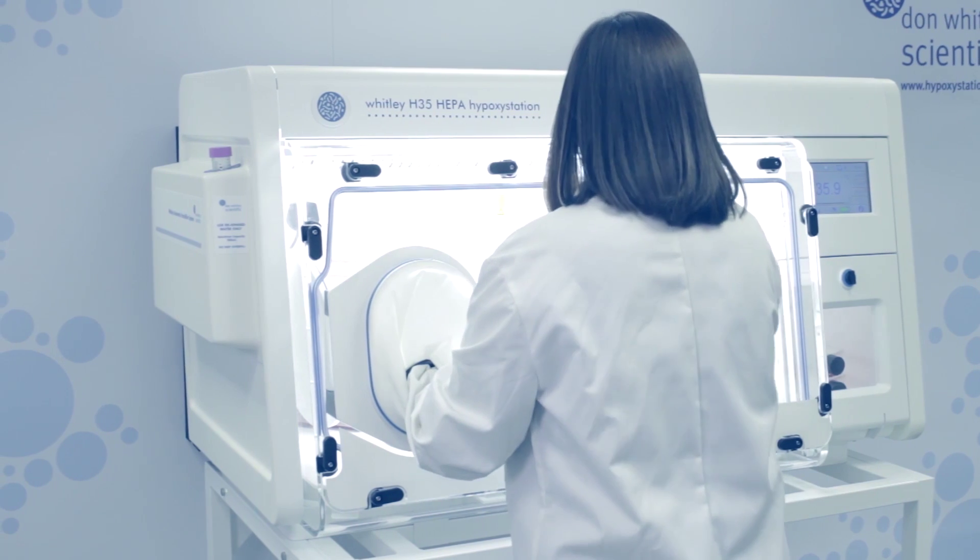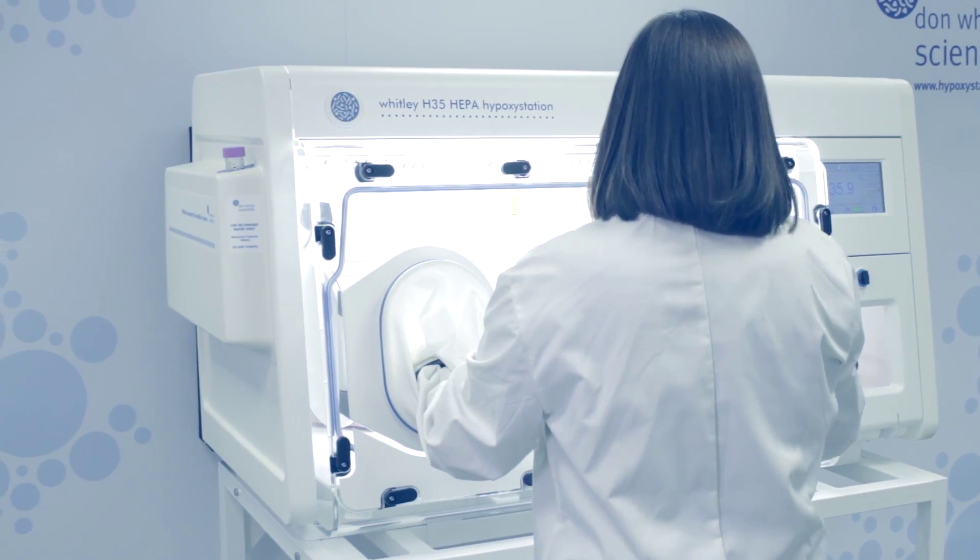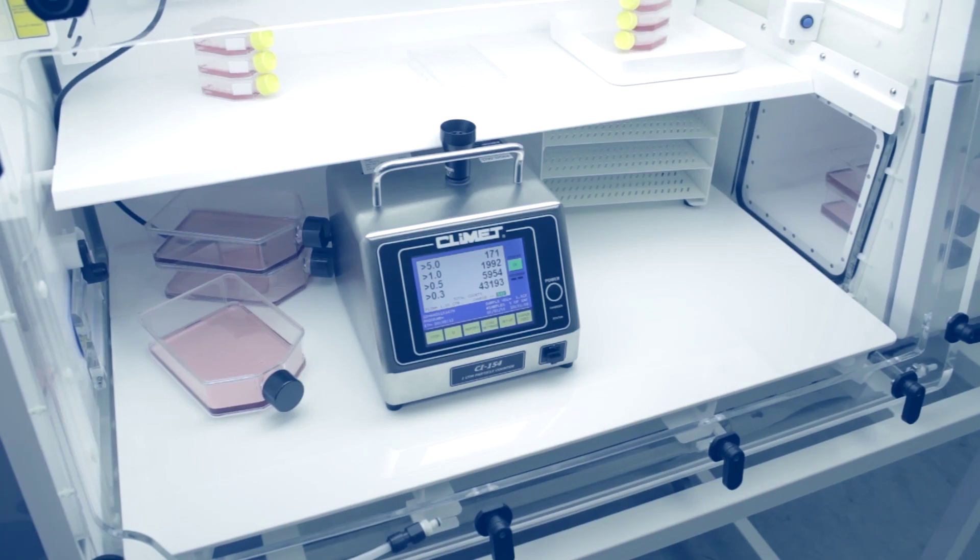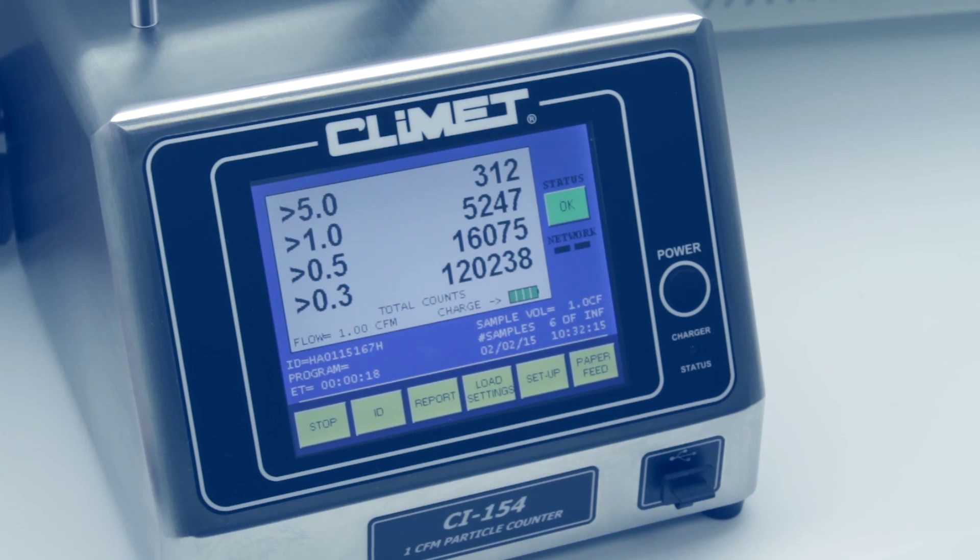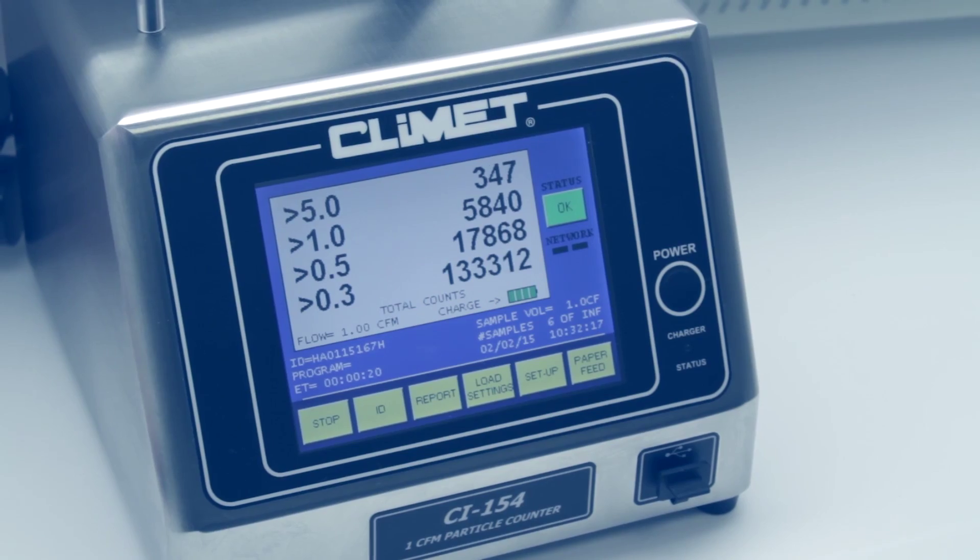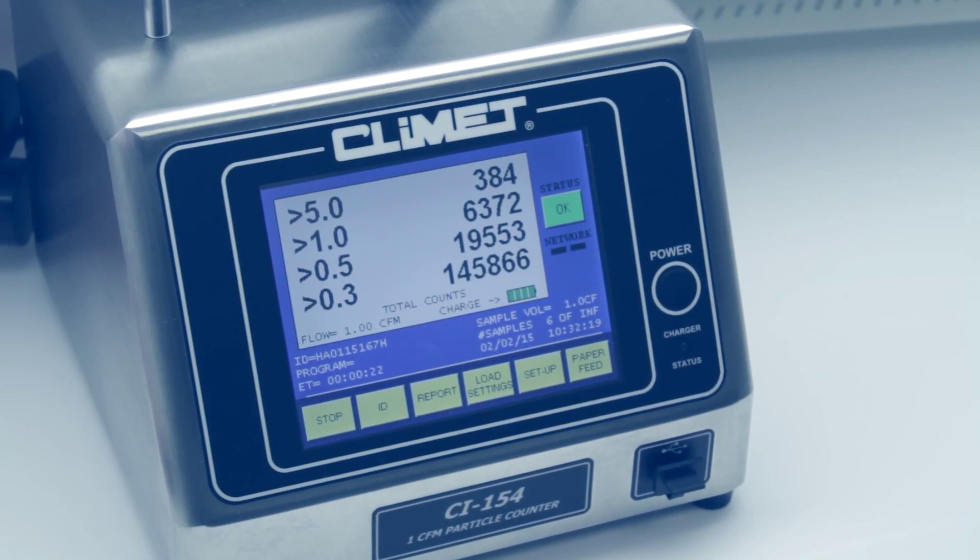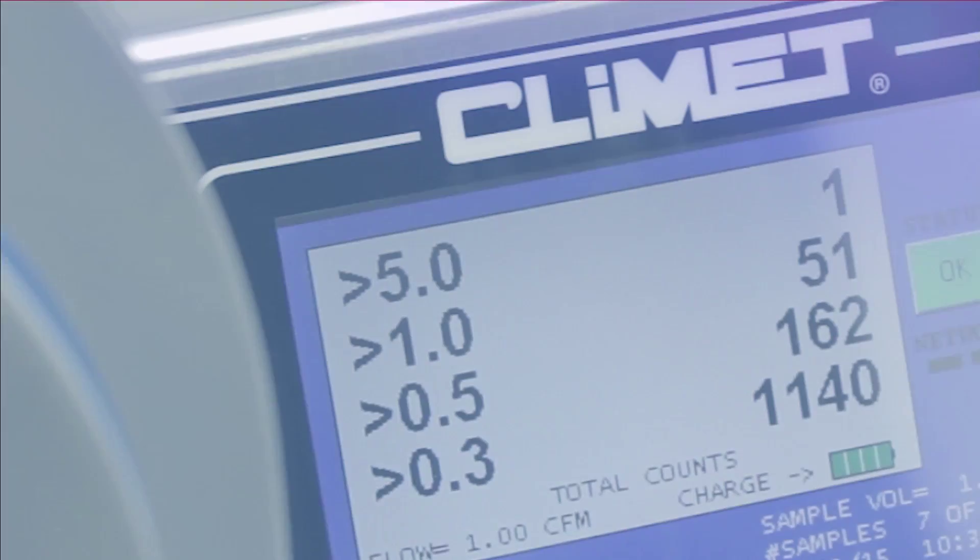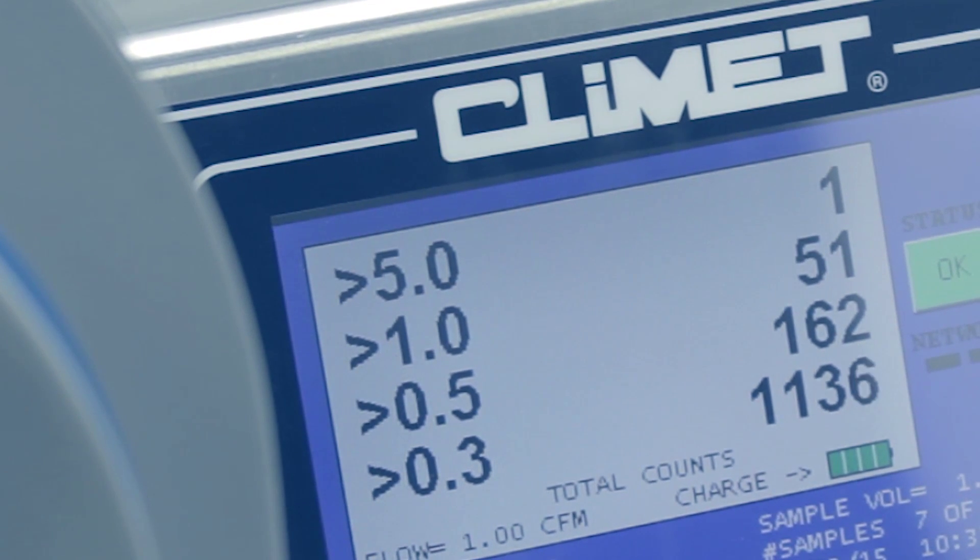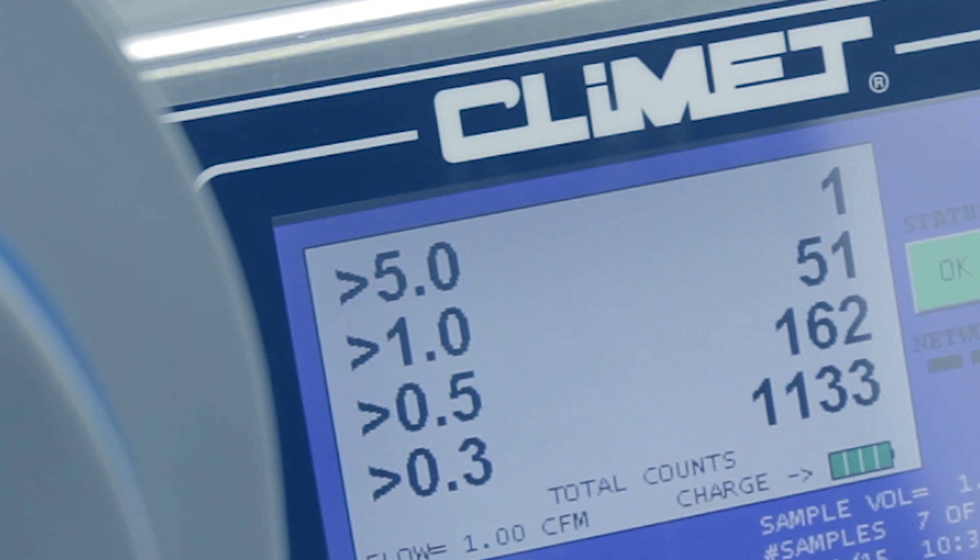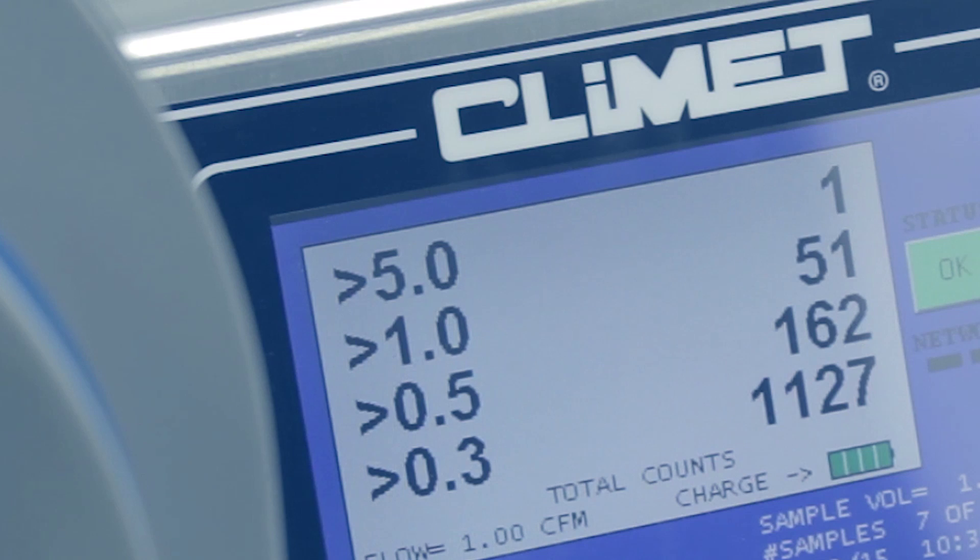One of the scientists in our in-house laboratories has been conducting work in a Whitley H35 hypoxic station. Normal laboratory background levels of particulate are high. Once the workstation is closed up and sealed, after sampling just two cubic feet of atmosphere inside the workstation, observe how low the particulate count has become.